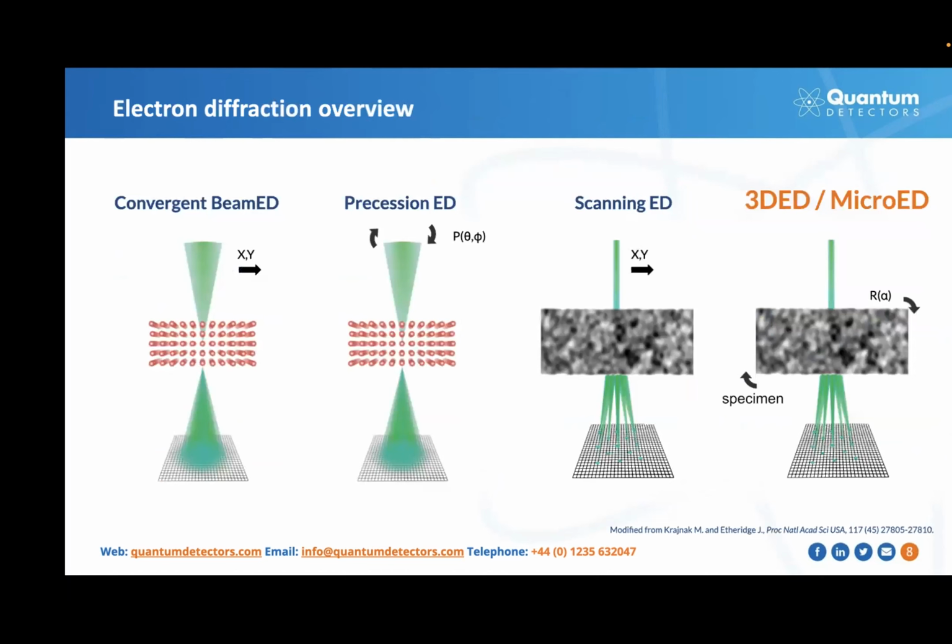And let me briefly discuss differences in electron diffraction modes. Firstly, we can choose convergent beam diffraction, as shown in the very furthest left panel, or combine it with a small angle beam tilt to perform precession electron diffraction. Another experimental option is nanobeam diffraction, which utilizes a small nanometer-sized parallel beam.